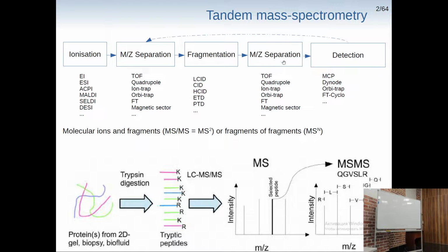And a detection: for an Orbitrap mass spectrometer, separation and detection are in the same volume. In a time-of-flight mass spectrometer, of course, we have a special detector. It wasn't clear why we need it and how we can do such an approach. Okay, then.